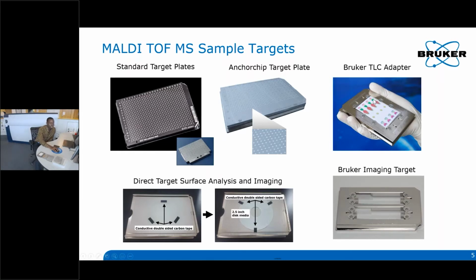We also have a TLC adapter. So if you're doing TLC MALDI experiments, there's an imaging target as well that can fit two ITO glass slides that are conductive for tissue imaging and other imaging experiments. And lastly, we have a direct target surface analysis that you can actually put any type of sample on, surface samples, of course, something that you would want to image.